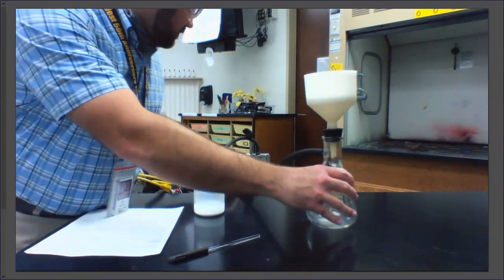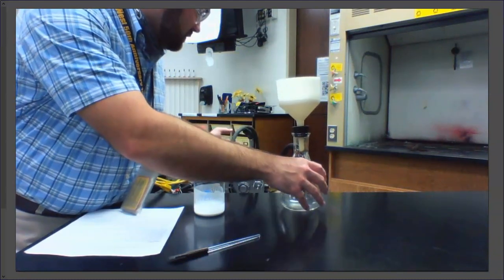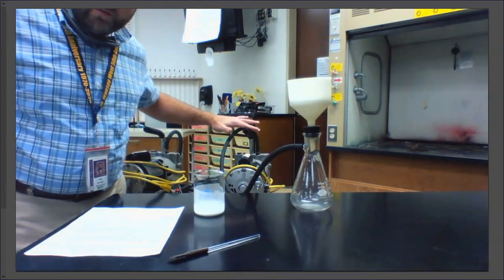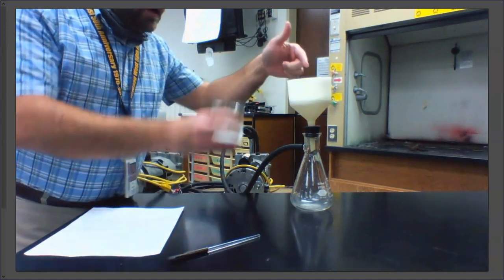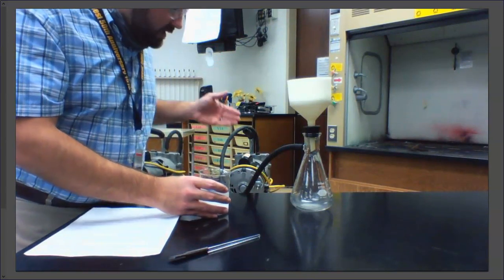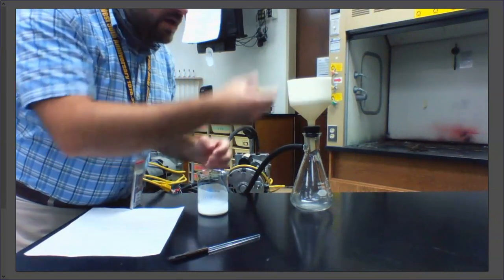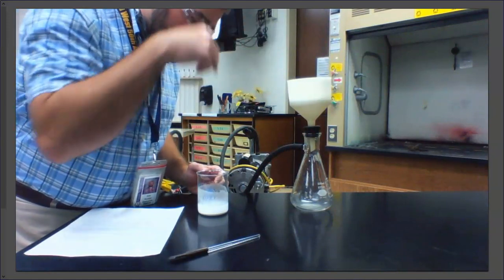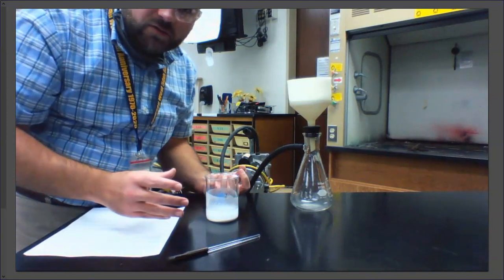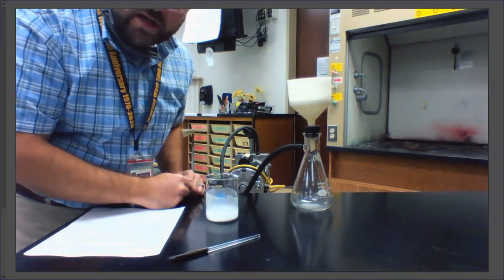So behind me on the cart, as this hopefully stops trying to tip over, there we go. On the cart behind me, I have a vacuum pump. When I pour this onto my filter paper, which I'll begin doing in just a second, the vacuum pump needs to be turned on, and essentially it sucks all of the air out of here and creates pull or suction through the filter paper so that as I pour this, all of the liquid is getting pulled down and through, but the solid obviously can't go through the paper and it gets collected on the filter paper, which we're going to grab later, and then we're going to dry it in the oven on the back of the room that I have as well.